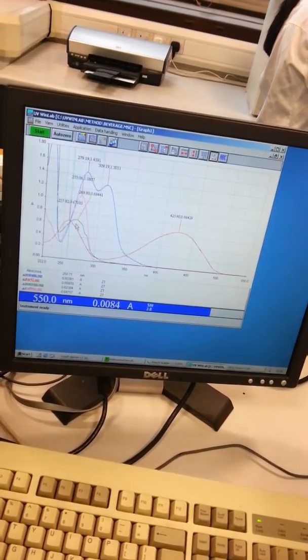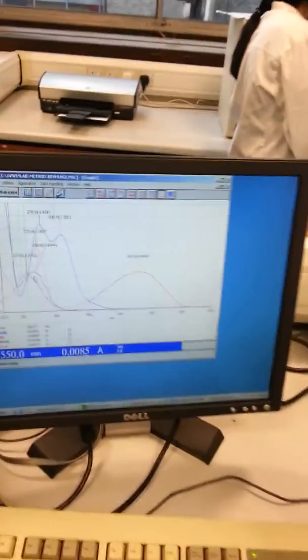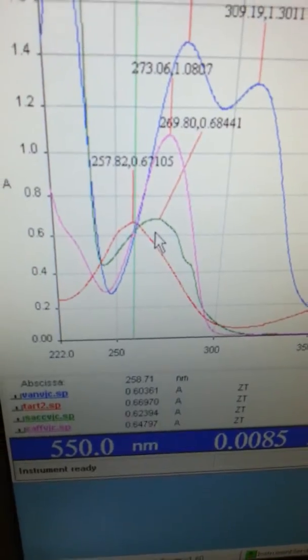So then saccharin and then caffeine. And you're doing yours at 258? What do we do next week? Then we make a solution of... Basically, you're going to set quantitative standards. You need to keep these you made for next week for the qualitative side, because if you've got 4 compounds, each absorbing at that given wavelength, you'll get 4 peaks. The thing is, you don't know which peak is what if you put them all in together, do you?